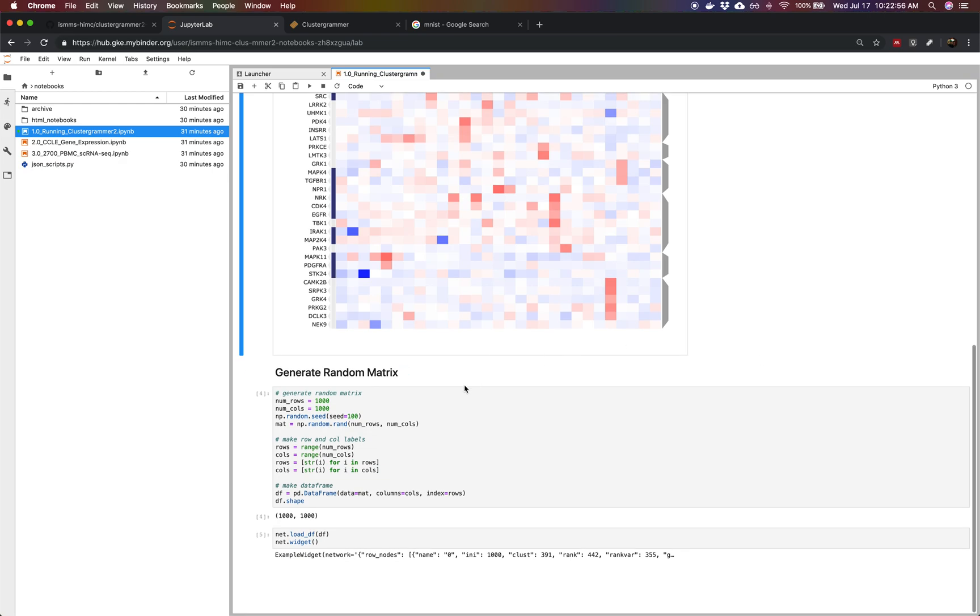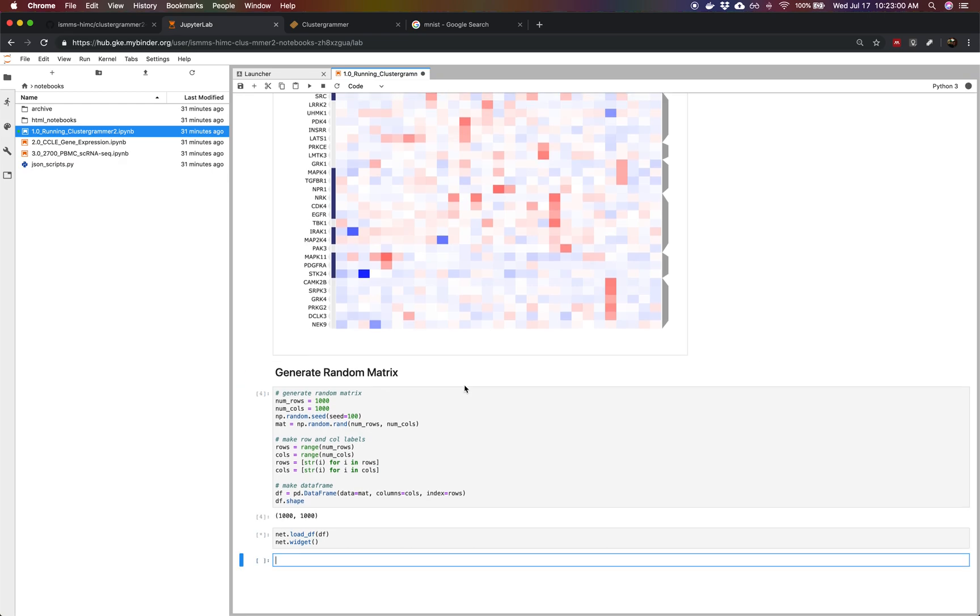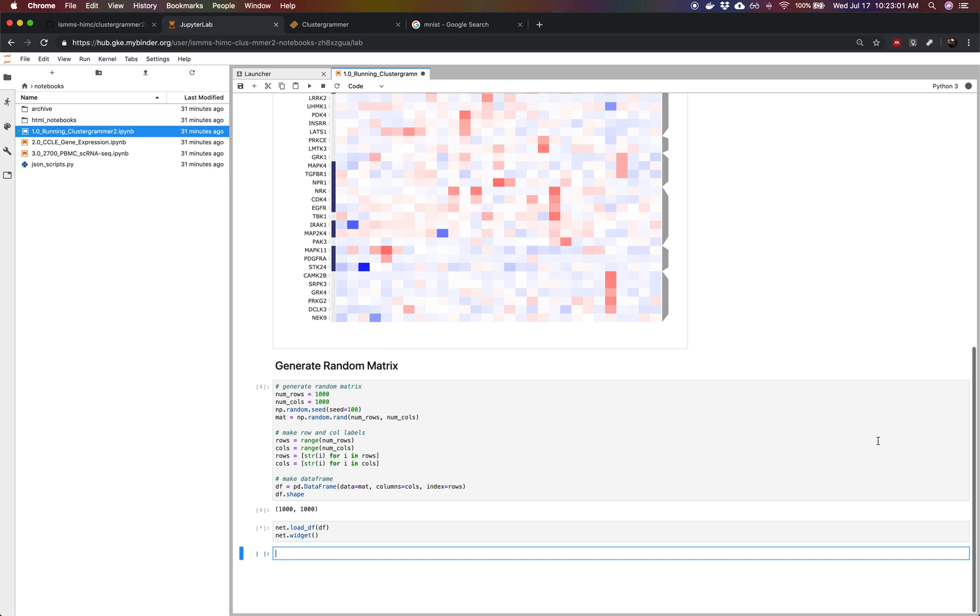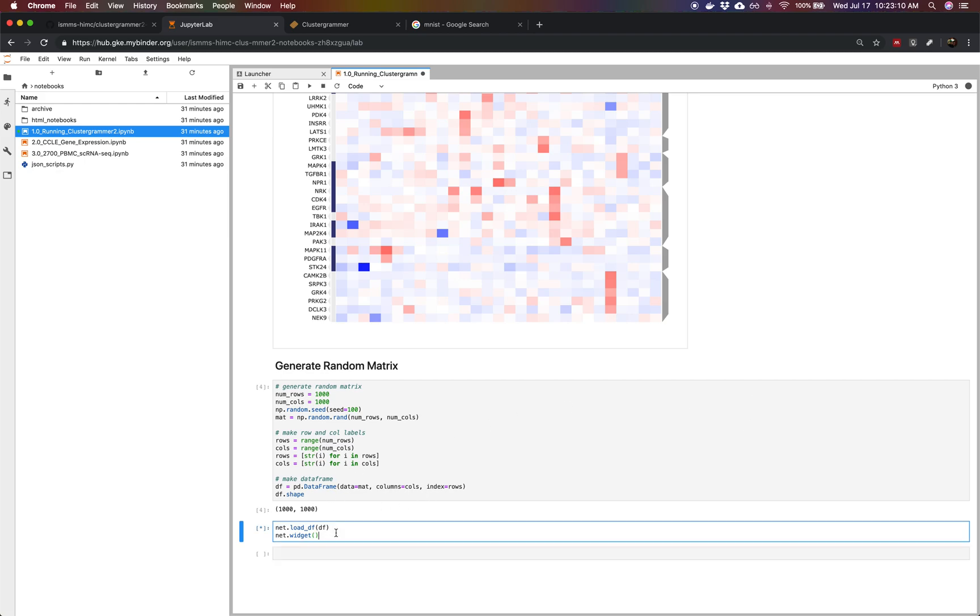The next section of the notebook generates a larger dataset, a data frame that has a thousand rows and a thousand columns of just random numbers to show you how we can visualize a larger dataset and how we can upload the dataset via a pandas data frame.